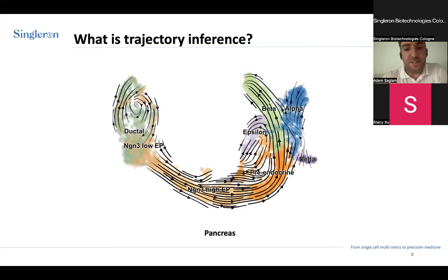But these slight changes in the transcriptome profile are, of course, due to some biological variability, but also due to the fact that not all cells at that time of the experiment were at the same status. It's like some cells were already dividing, some cells have already divided, and some cells are just in the middle of the cell division, for example.